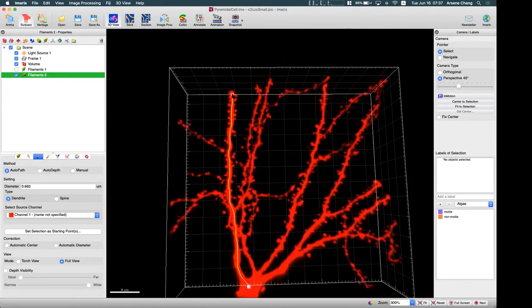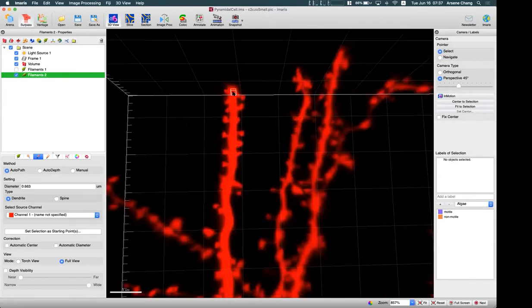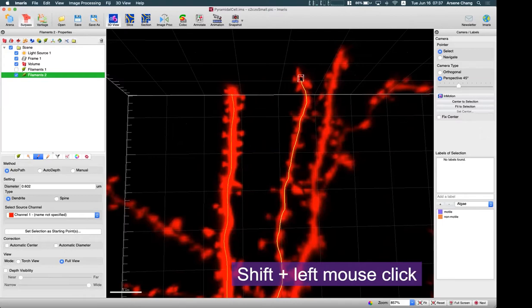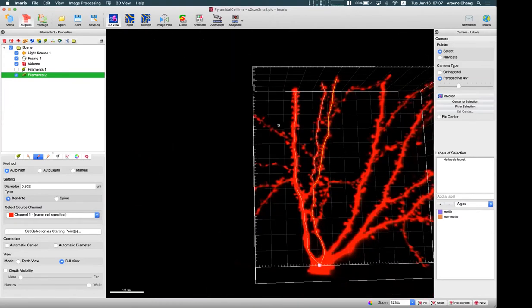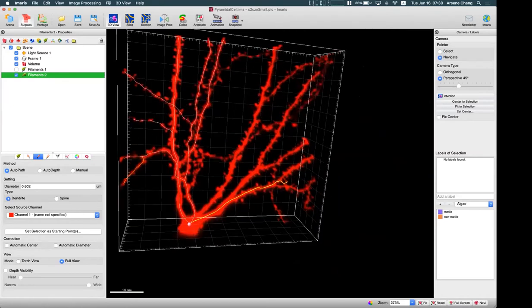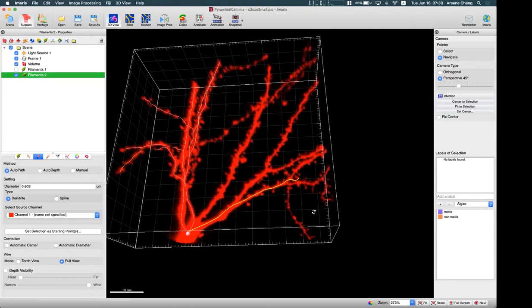Imaris will automatically try to link voxels as part of the dendrites by comparing intensity between the mouse pointer and the starting point. This is the same as the previous semi-automatic auto path detection. Just make sure your mouse size matches the diameter, then hold Shift and left-click to complete all the branch points.